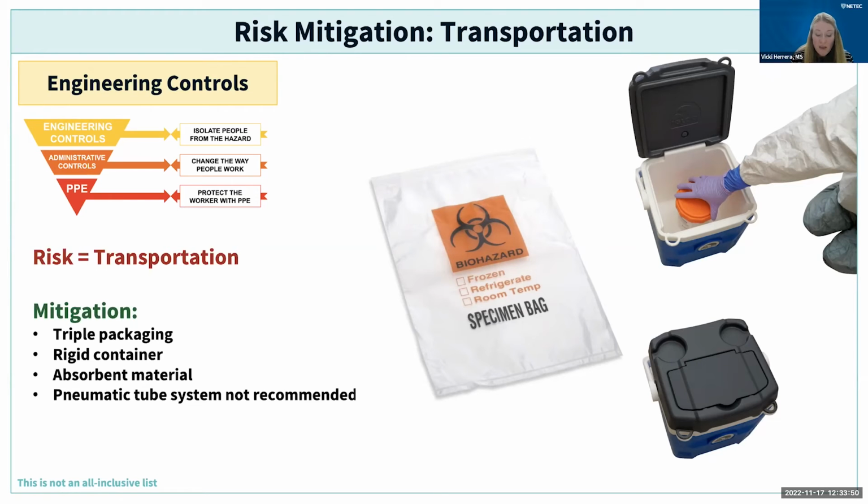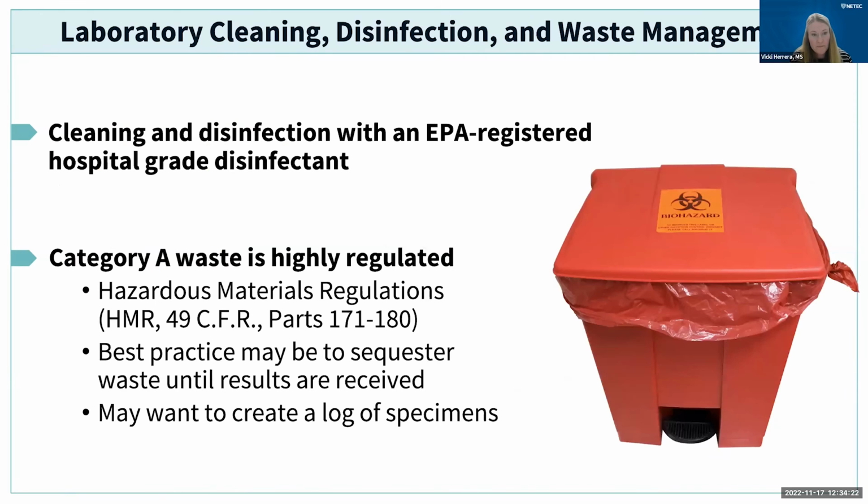So just making sure that you know exactly where that specimen is going. There's many other considerations when you're shipping or transporting outside of a facility that I'm not going to go into today. There's lots of webinars that will discuss packaging and shipping. So this is strictly talking about how to get something from point A to point B in your facility, thinking through every single one of those steps and maybe looking at what is your route, how many people are on that route. So again, different things to think about. Next slide, please.